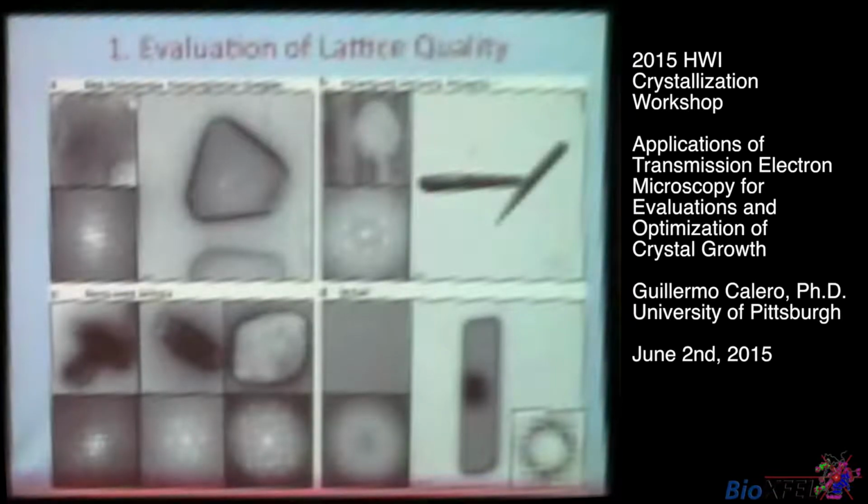So the first thing is, we can now break every single nanocrystal using these protocols, and we can look at the lattices. So can we see differences in the FFTs or in the lattice among all these crystals? That would give us a hint of which crystals diffract better than others. So basically, here's the answer. This is some of our RNA polymerase transcriptional complex. You can see the crystal here, before fragmentation and after fragmentation with FFT. It's a really nice slide.